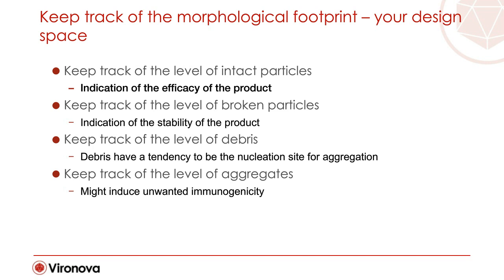Keep track of the level of broken particles as it is an indication of the stability of the product. Keep track of the level of particle debris or host cell debris as they have the tendency to be nucleation sites for aggregation and unwanted immune responses. And keep track of the level of aggregates as it will induce unwanted immunogenicity.